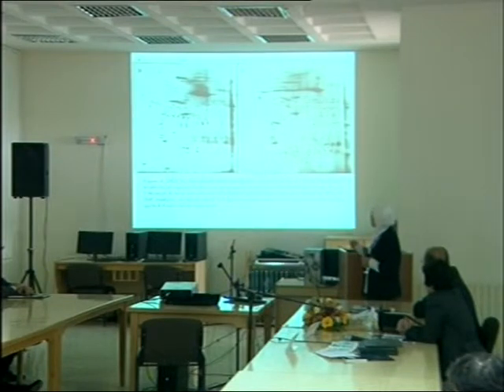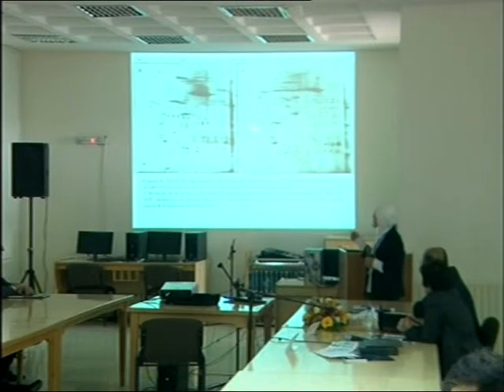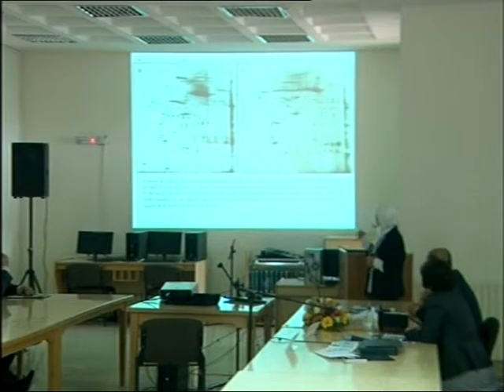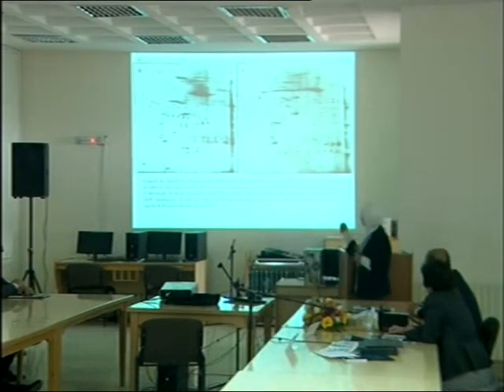So two-dimensional electrophoresis was performed on many samples representing many stages of the disease, from stage 1 to stage 4, and we compared them using Bio-Rad PDQuest software. We compared the protein expression among samples from different stages of the disease. This graph shows sample number 1, for example. The software has biomarkers we can use to make sure that samples represent the same tissue, or different tissues, and that both are from a stage 3 patient.